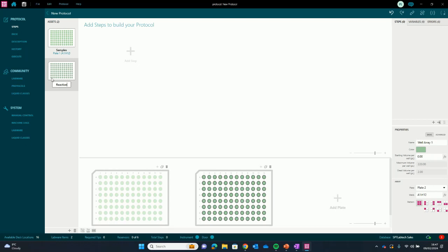For any object that's selected, if you go down to the right hand panel, you've got the properties of that object. So here I can actually go into a color palette and change the color of that. Let me pick something that contrasts well with the green. I'll pick this pink color. So if you have color coding within your workflows, if that's useful, it's very easy to set these up any way you want. So I've now got two plates.